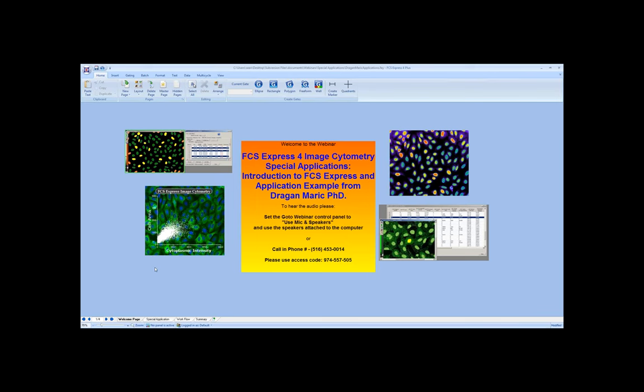But to get started today, I want to show you a little bit about how FCS Express Image Cytometry works, and then we'll progress into what Dragan has done so skillfully with it to get some interesting results.